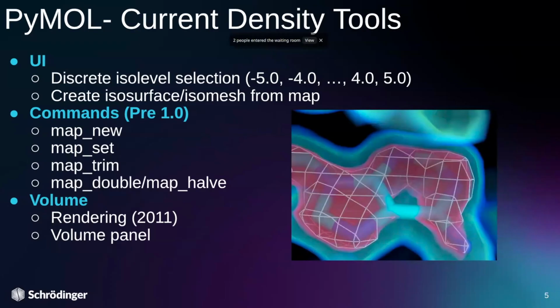But a lot of these things are not really well exposed or documented. These tools do exist, and this is one pain point that we hope to address in 3.3 by providing a centralized UI to do a lot of the processes that exist in people's workflows today.